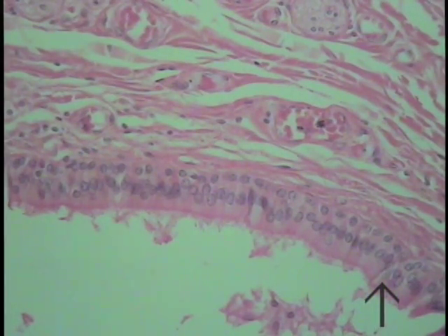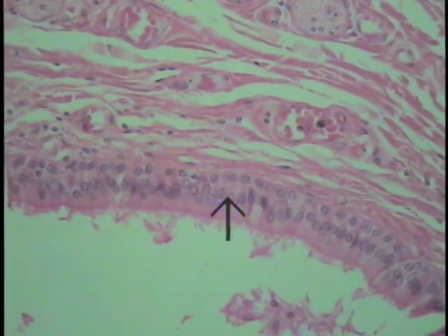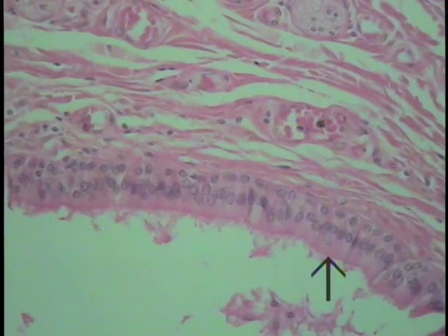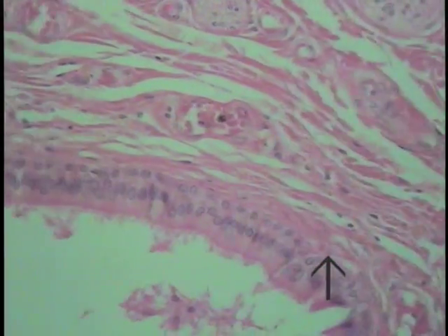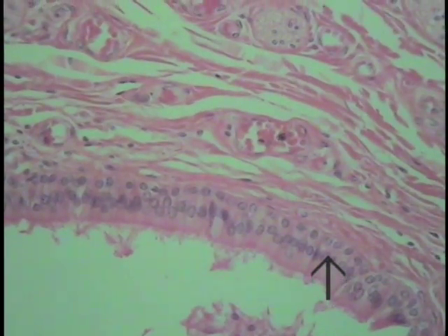Remember the classification scheme. Are two or more layers of cells present, the outermost ones of which do not contact the basement membrane? The answer is yes. What is the geometric shape of the superficial-most cell? You can see that indeed it is columnar, therefore it satisfies the definition of this epithelial lining being stratified columnar. Examine it at slightly increased magnification.